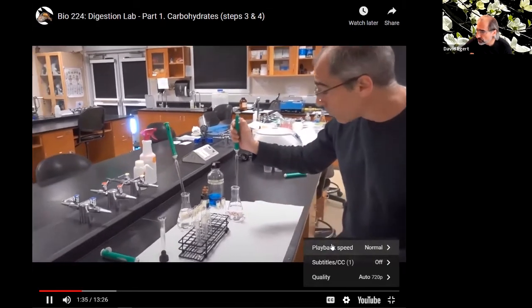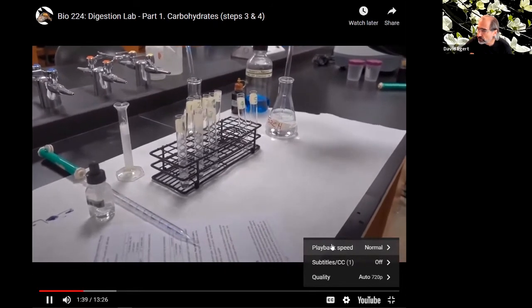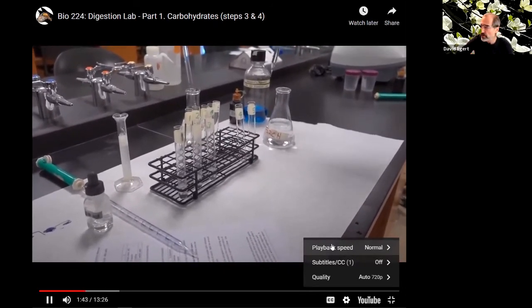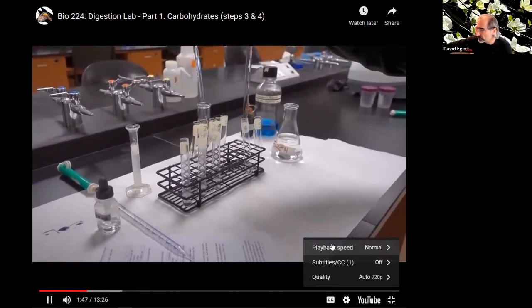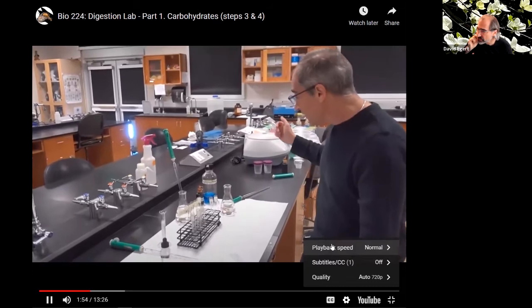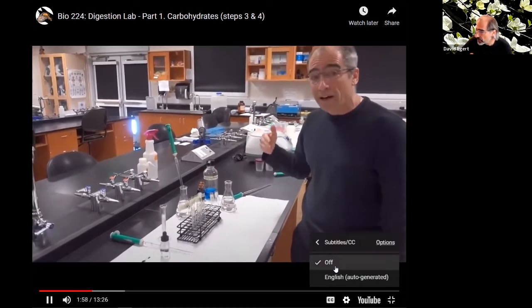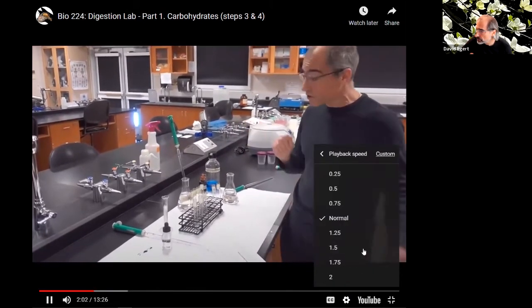So for test tubes 4 and 5, test tube 4 is just going to have pure starch in it. And when we do our test, it better say that it just has starch in it. Test tube 5 is where we're going to have pure maltose. I will put that in a little later. And when we check our assay for maltose, it better say pure maltose with no starch.